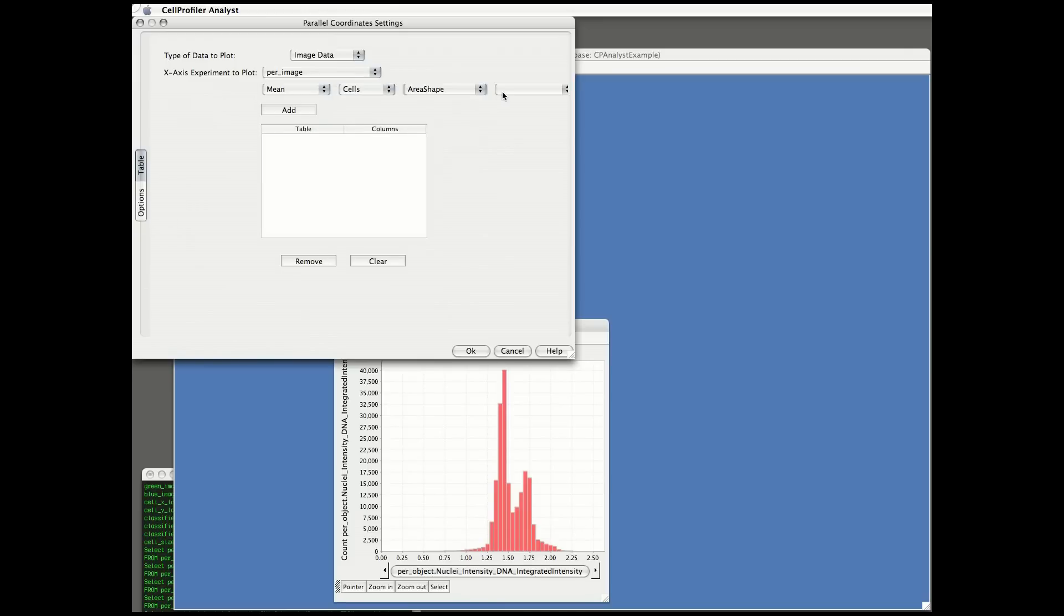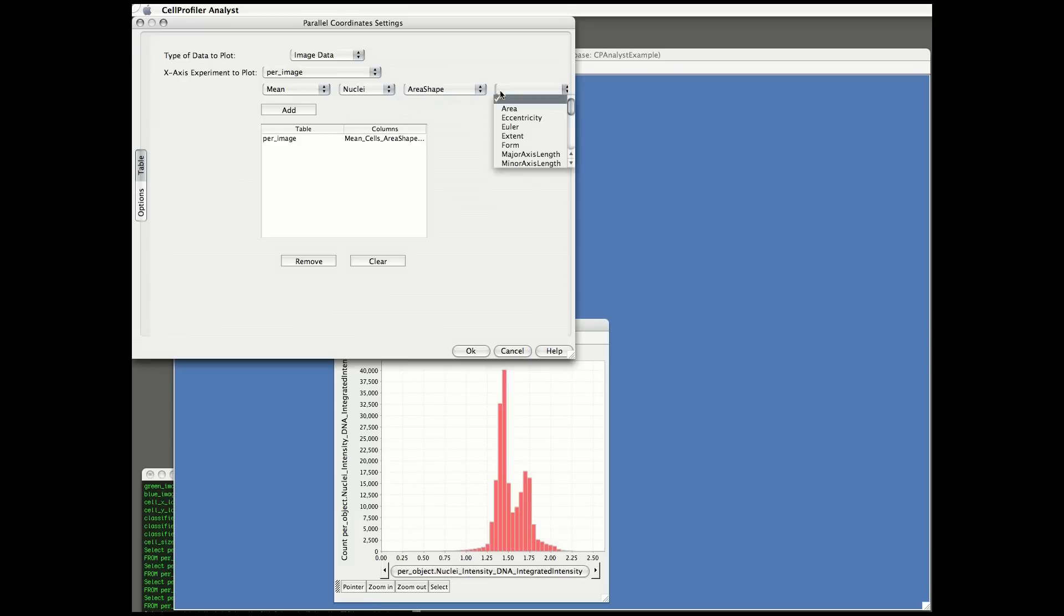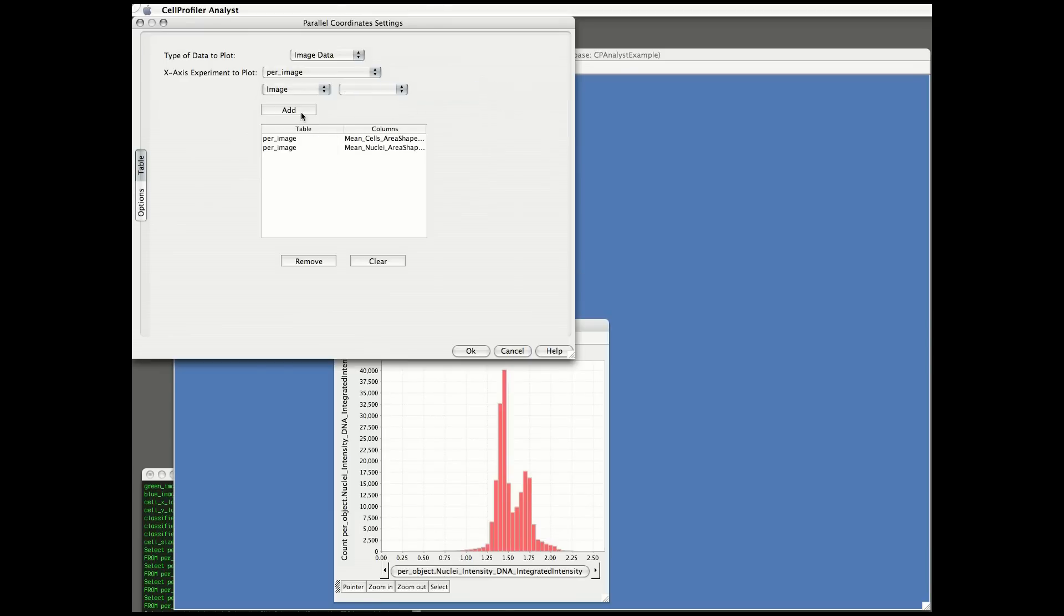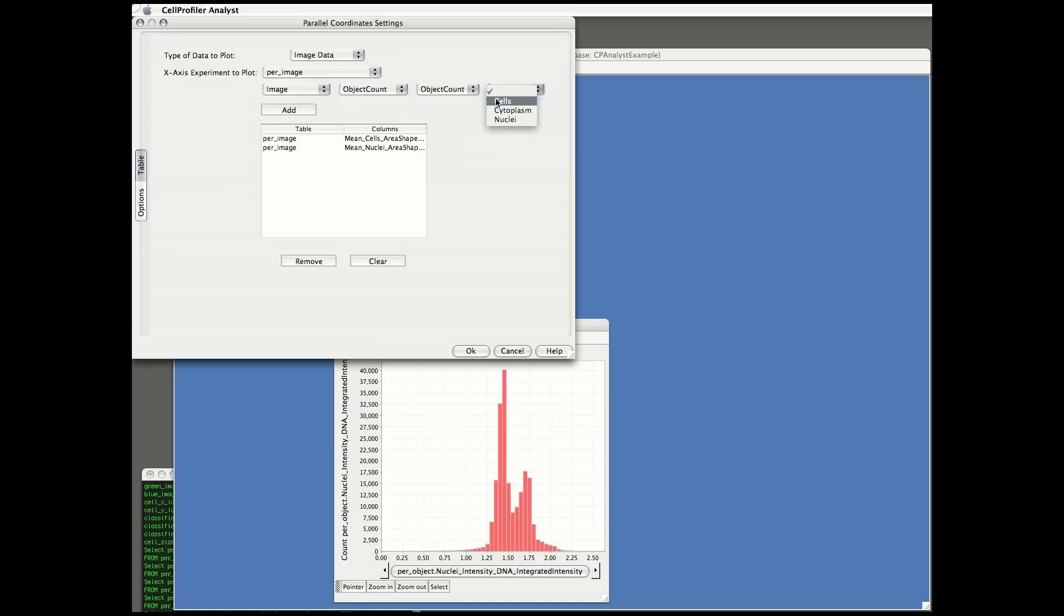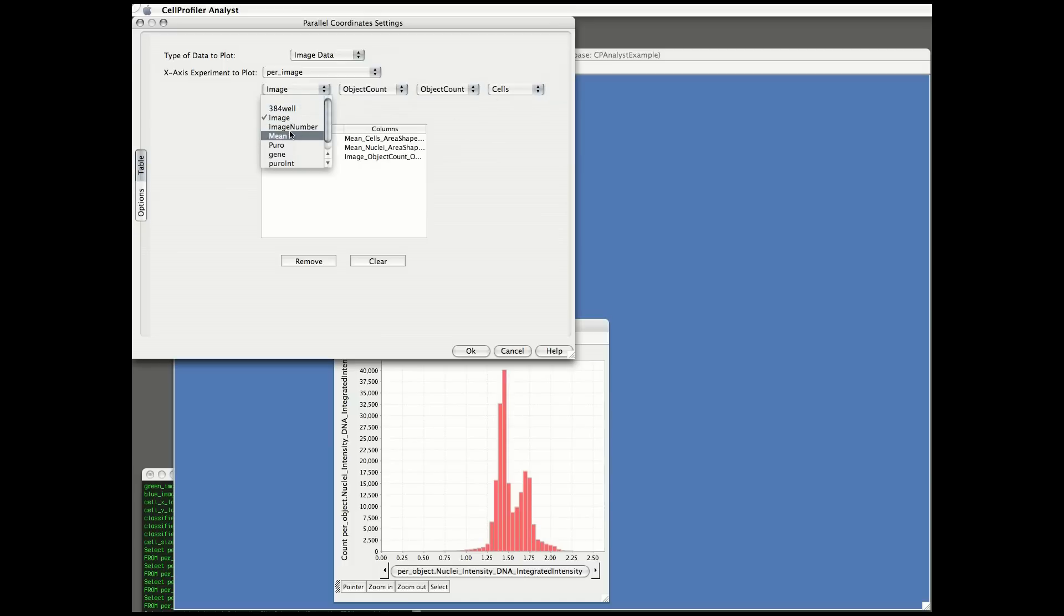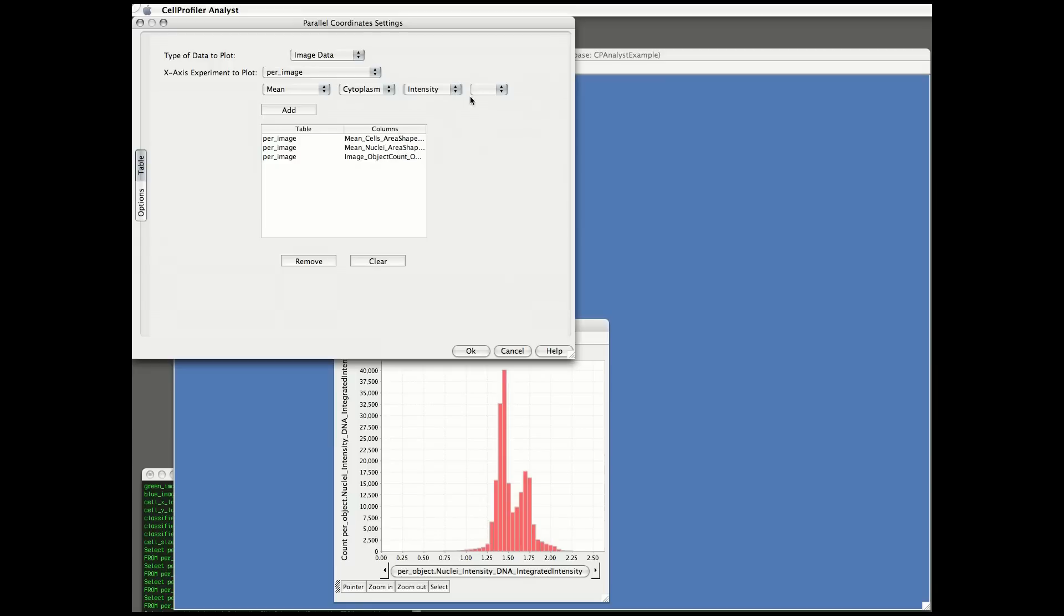Now I'm plotting a parallel coordinates plot, which allows plotting multiple features onto a single plot, whereas scatter plots allow just two features and histograms can only display a single feature of images. You'll see I'm choosing different features and adding them to a list. Each one of these features will become a different y-axis coordinate on the plot.